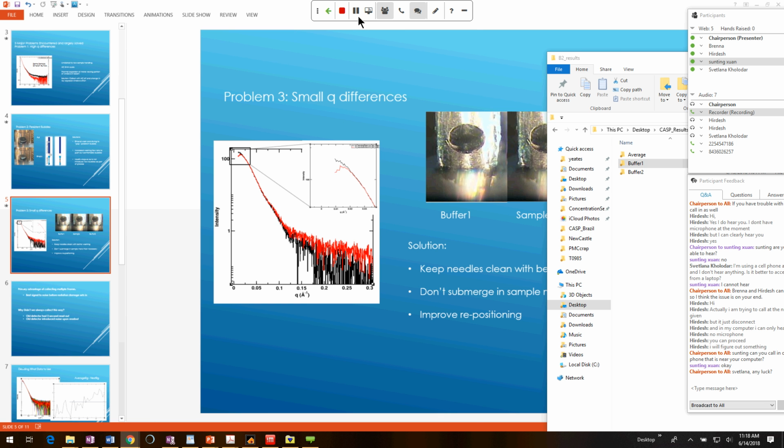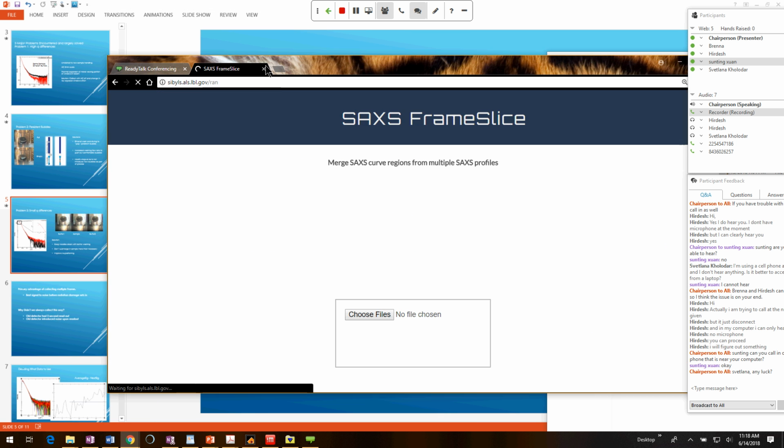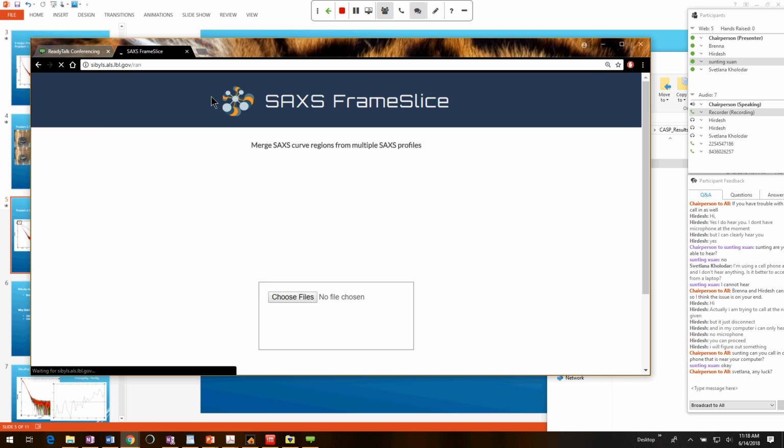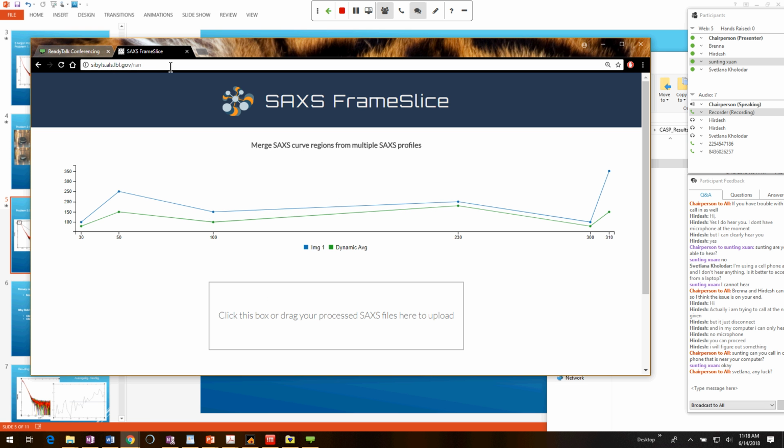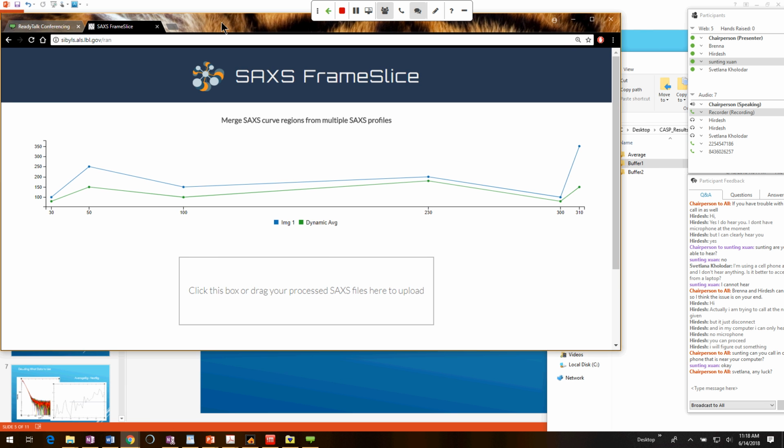All right. This is really what I want to show you. There's a web tool at SIBYLS.als.lbl.gov/ran. So that's on the web. You don't have to download anything. It's totally available to use, and we recommend you using it. There are other tools available that we haven't provided, so feel free to try those other things, but here's one way of doing this.